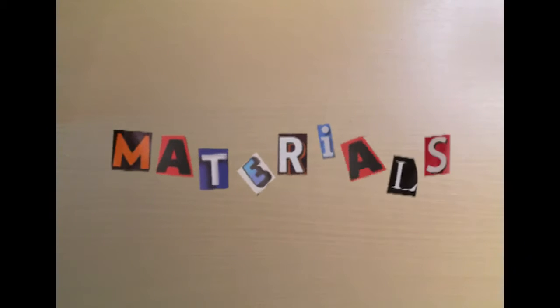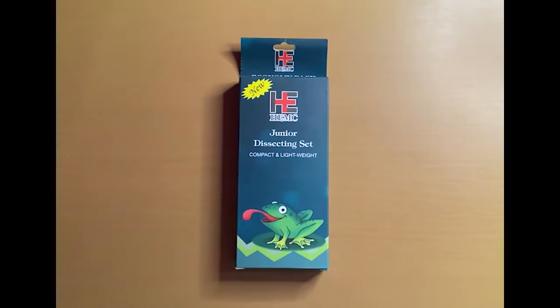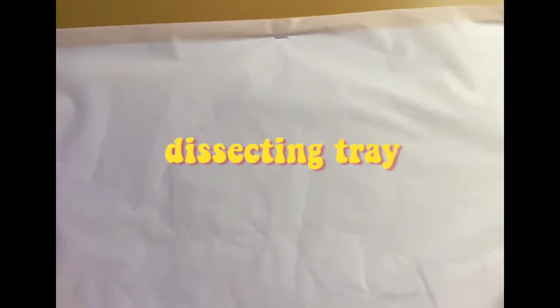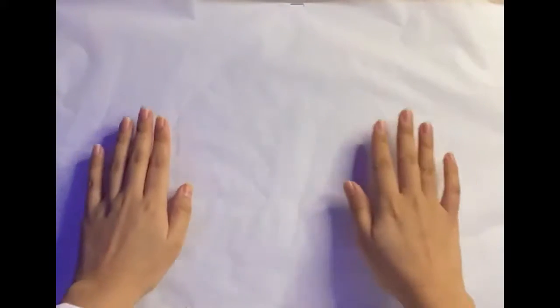Now let's identify the materials to be used in our experiment. First, we have our dissecting kit. I got mine from Beravan in Robinson's Bacolod. Second, we need a dissecting tray to hold our specimen. I used a corkboard and covered it with baking paper to avoid any spillage seeping into the board.